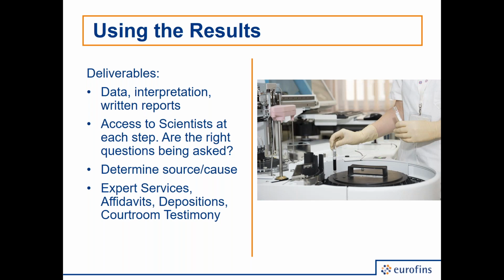Then finally, in terms of what's the deliverable, what is the result? Is it just data on a certificate of analysis, a number? I like to tell people it's kind of a dime a dozen. Anyone can give you a number on a sheet. But when you get data and pictures and spectra, chromatograms, and thermograms, and all the backstory, and you put it all together with interpretation, now that's powerful. That's greater than the sum of the parts.